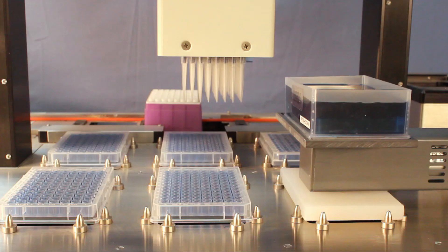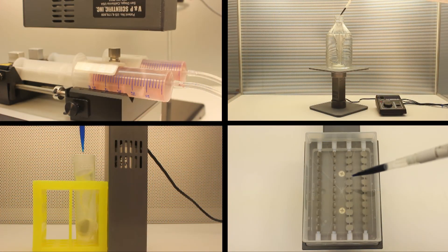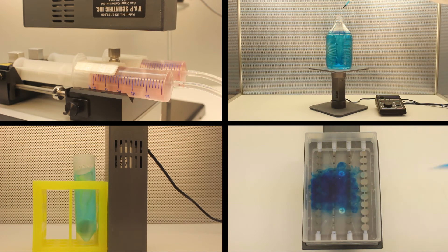The stirrer also easily integrates onto a robotic liquid handler by simply placing it onto an SBS size nest. One stirrer, multiple possibilities.